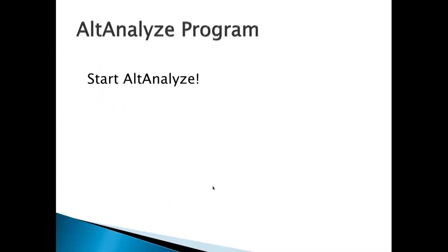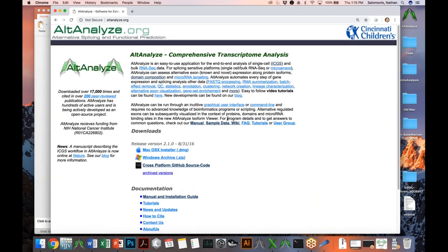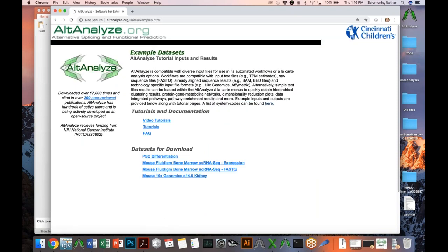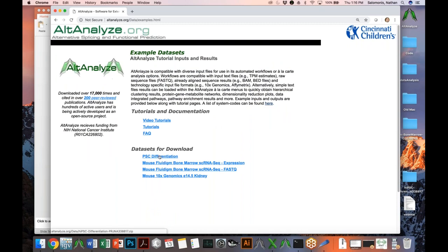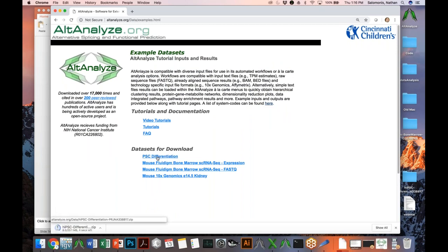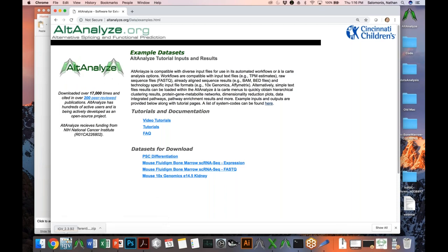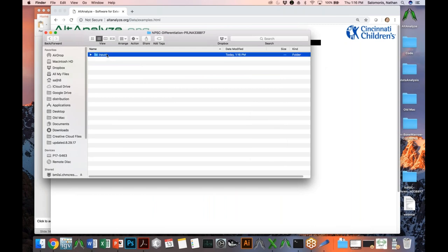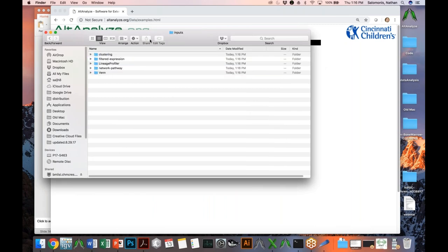With that background, we'd like to jump in and show you some ways to actually analyze your own data within the software AltAnalyze. Before we begin, go to the AltAnalyze website and find the link that says sample data. The data I'm going to be working with today is found in the link 'PSC differentiation.' Go ahead and download that, extract it, and there's a series of files inside in the inputs folder that we're going to use as our sandbox today.